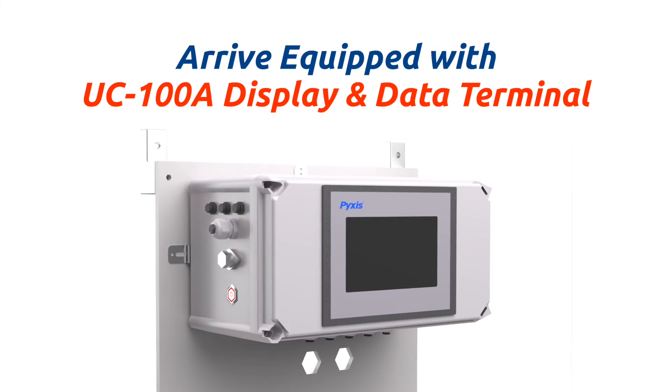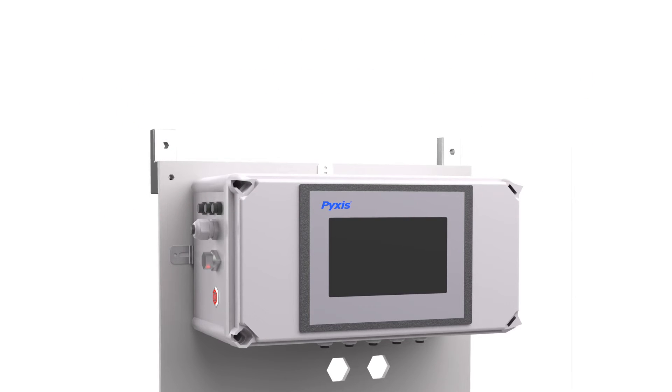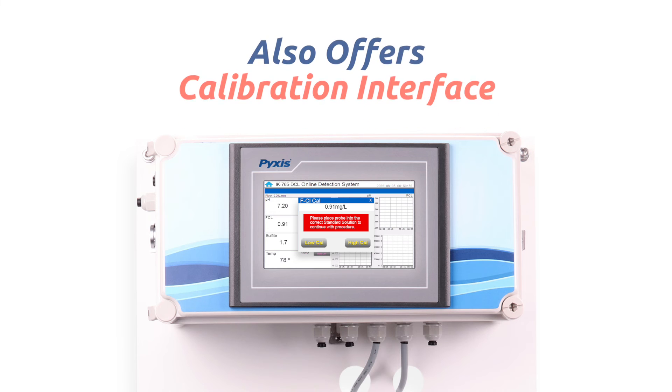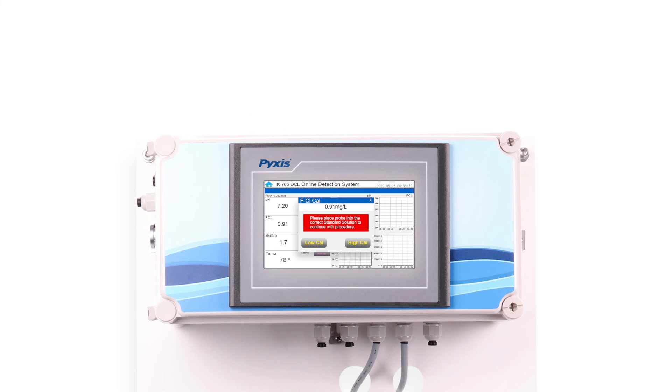The IK765 DCL panels come equipped with a Pixis UC100A microprocessor-based fully programmed touchscreen display and data logging terminal that comes pre-wired to the sensors provided on the panel, allowing for rapid deployment and startup. The UC100A provides live display and historical data trend charts for each sensor input as well as a sensor calibration interface, while logging data of all inputs via USB download or transmission through analog and Modbus RTU or TCP.